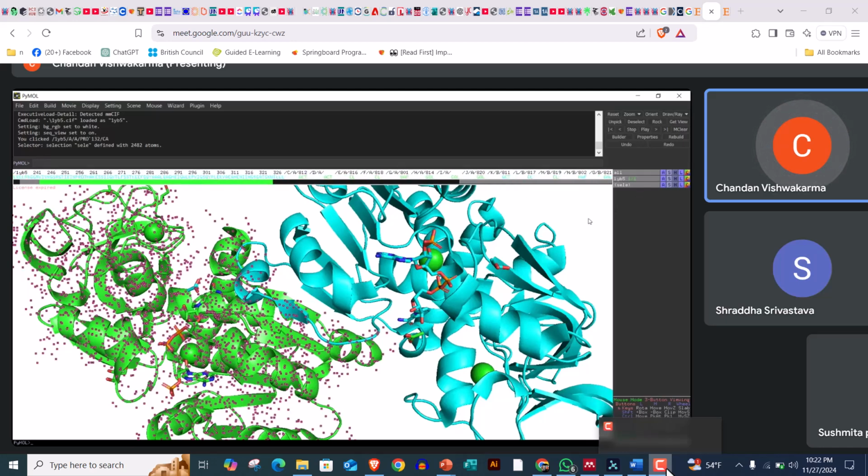So you just select the NADPH also of this one and rename it. So A is with glycerol also. There is no need of glycerol, but I just keep it here in the A chain. And these are the four different molecules. One is the glycerol that is present in the A chain of the protein, and this is NADPH. So there are three glycerol and one.